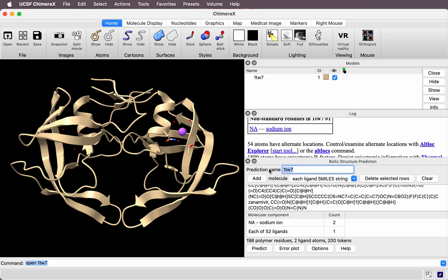I can change the name of the prediction—this is the directory where the run will be done. I'll say HIV protease and press predict.